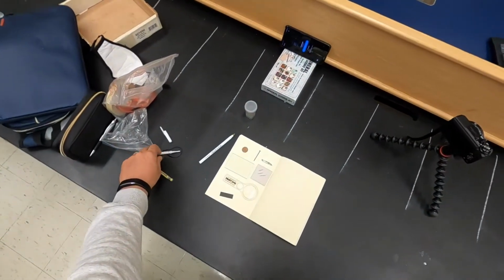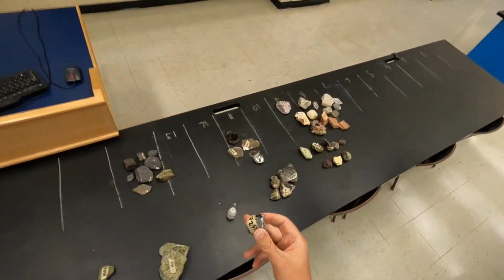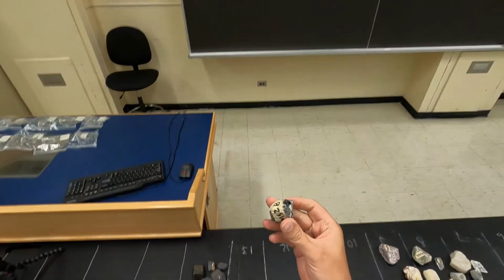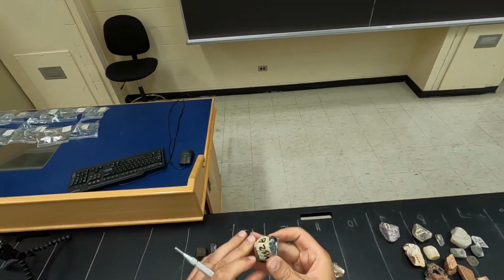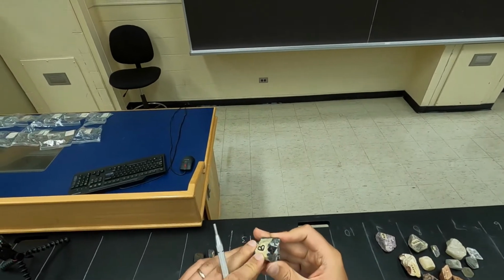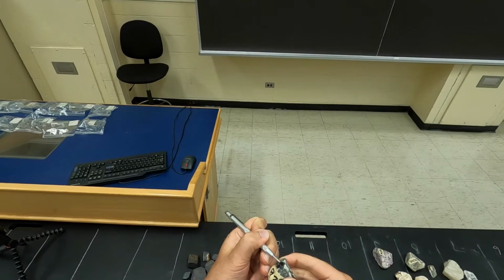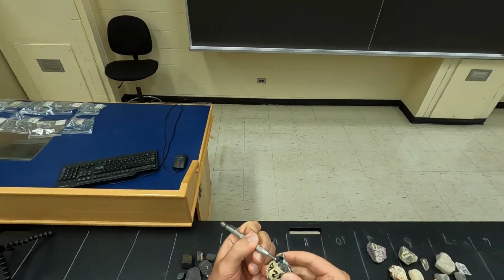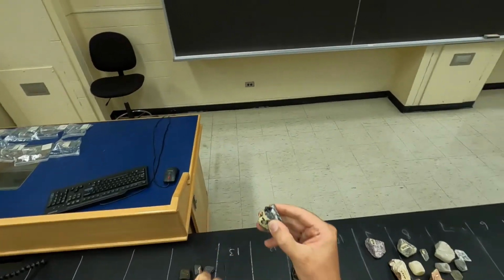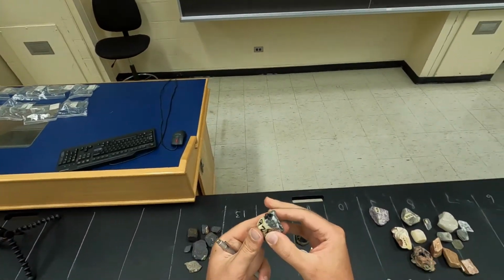So let's get a pen to just illustrate this feature. You can see this dark crystal is quite shiny, and I can see here roughly an edge of the crystal and also another edge here, and it forms 90 degrees. So I hope I convinced you.